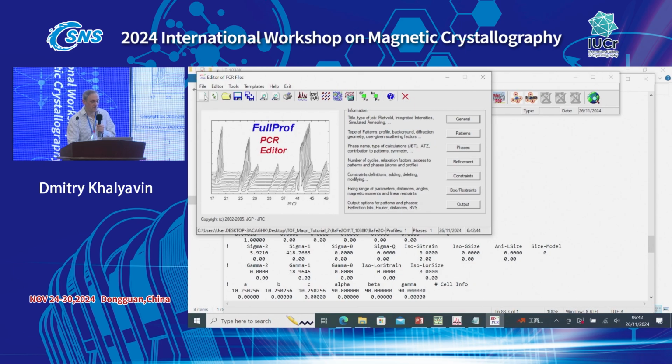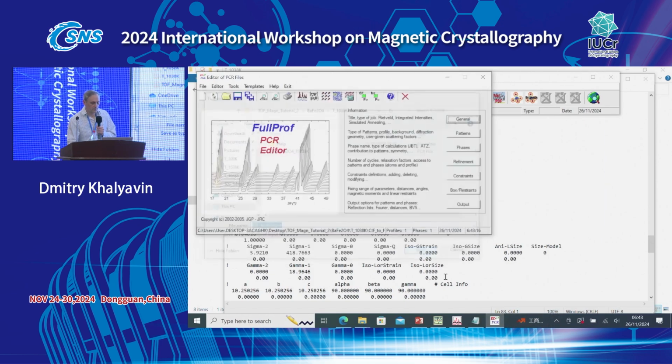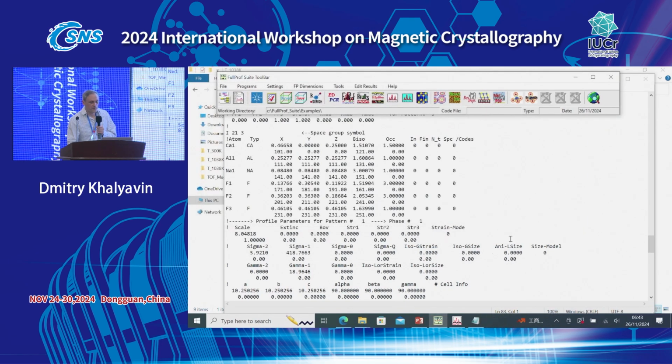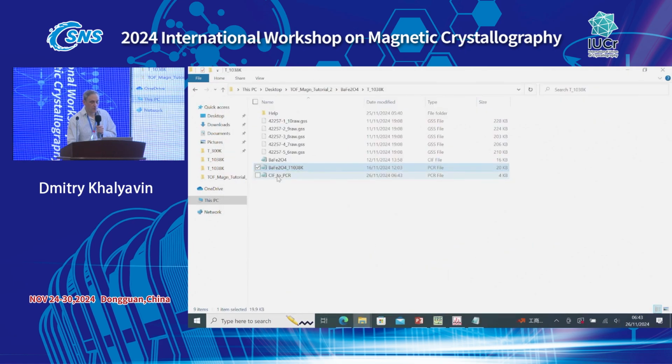So if I save this, I can give a name, let's say, CIF to PCR.PCR. Then I have my model imported to a PCR file.